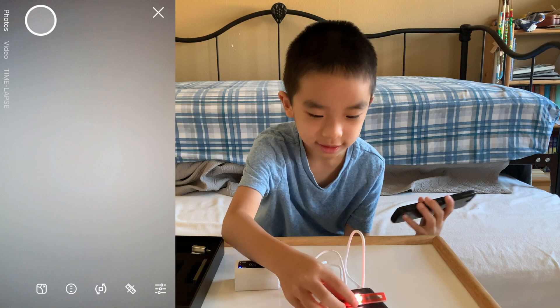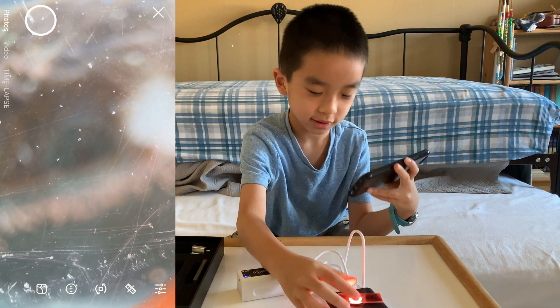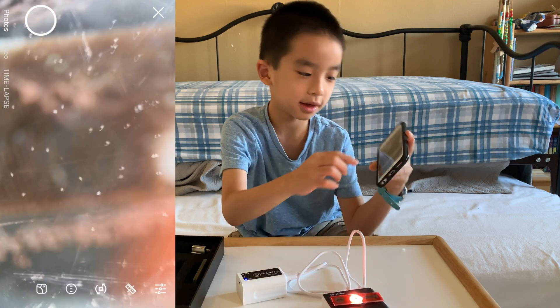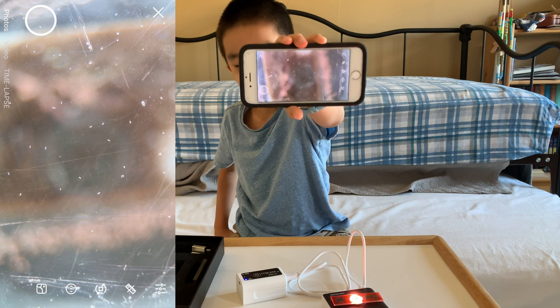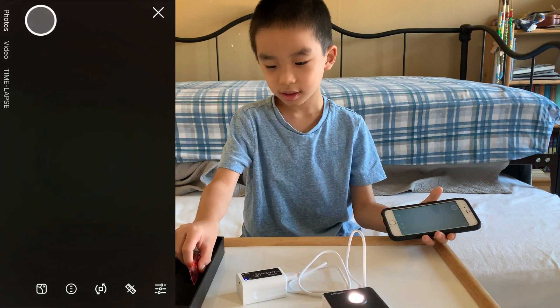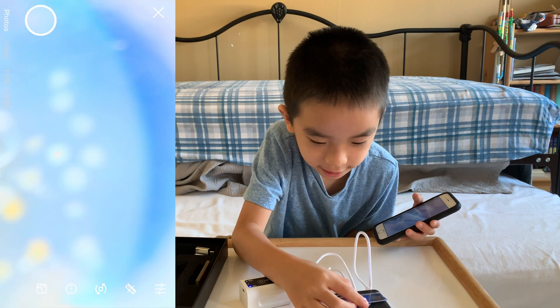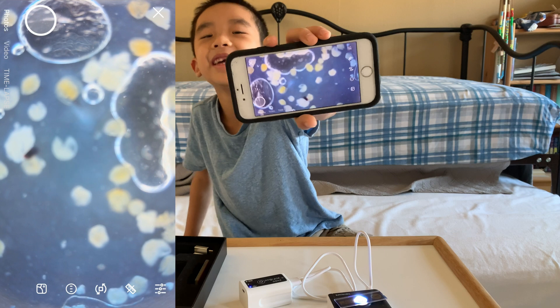Next is the butterfly wing. I think it's that brown square shape wing that you see. I don't know what butterfly that is. Lastly, here's the plankton — I think it's plankton eggs. You can see all the tiny eggs.